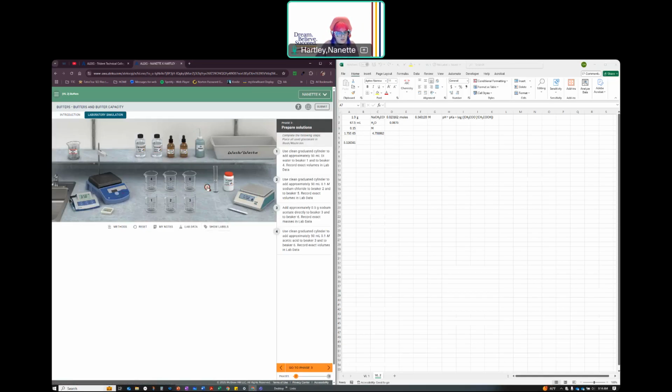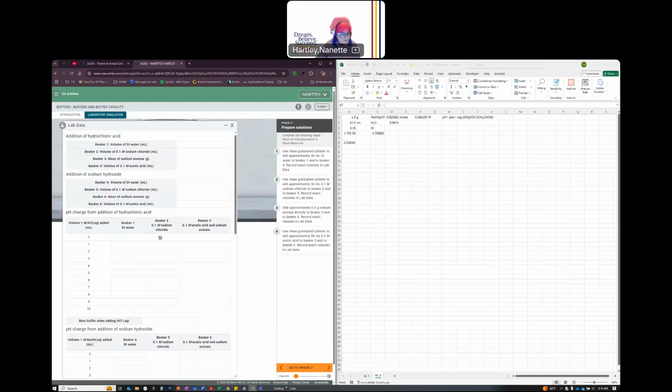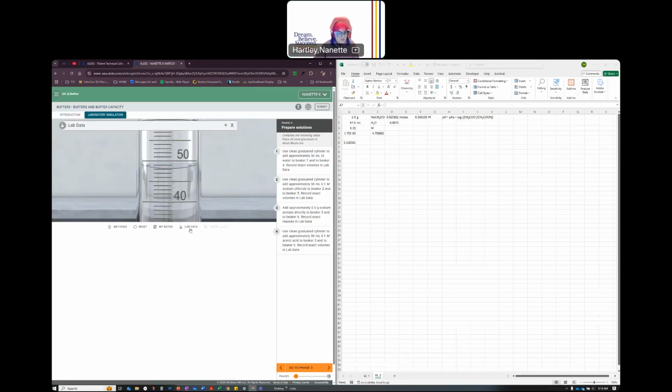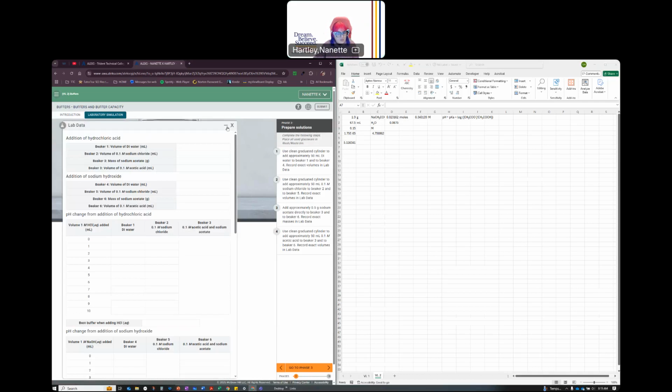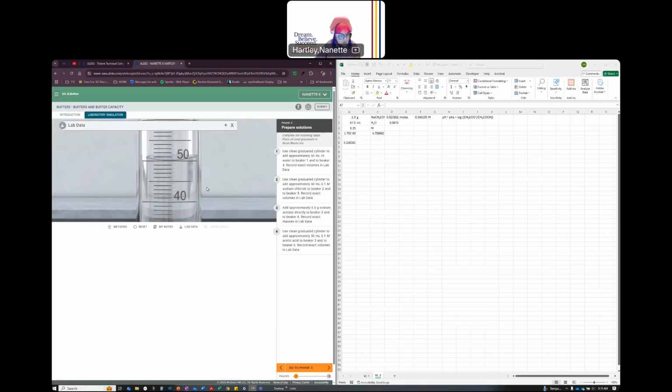Add this here. That is 45, 46, 47, 48. This one's 50.